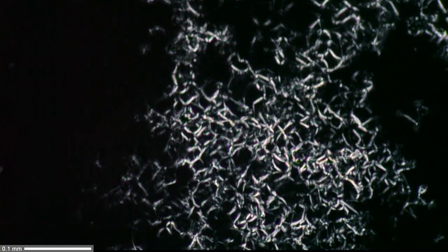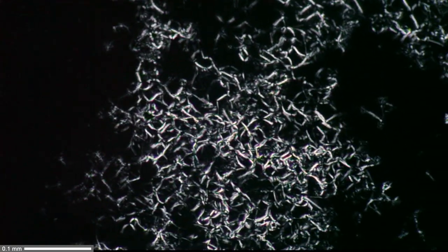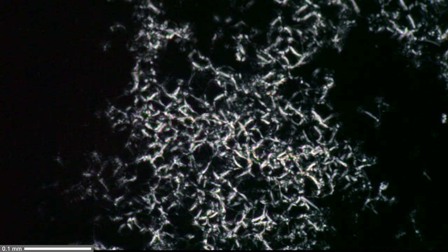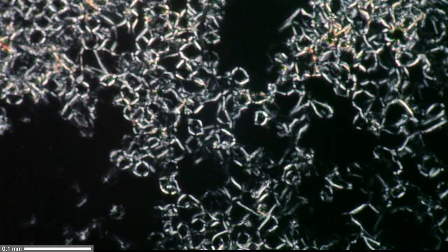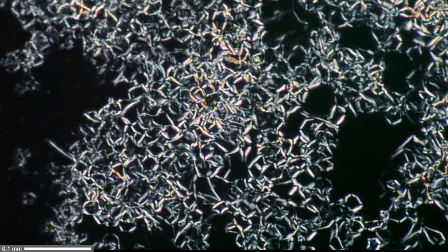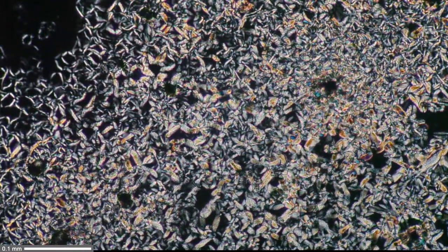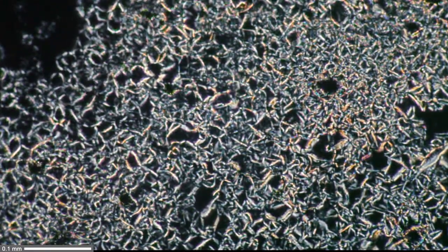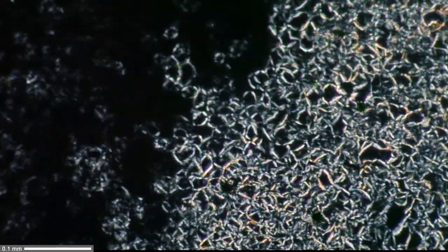All of those white structures, these are crystals and I'm using currently the 20 times magnifying objective. Unfortunately, I could not get a higher magnification because of the small distance between the objective and the filter and I would have crashed my objective into the filter, but I think it does look quite nice and you can see the individual structures and a little bit of color as well. You have to look carefully.